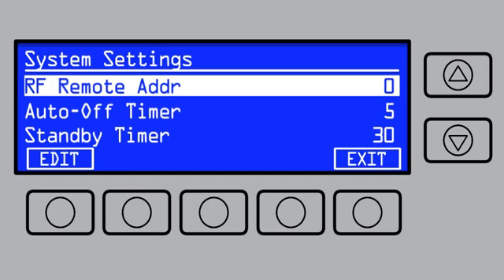If you want to add an additional remote control, follow the steps in your user manual.